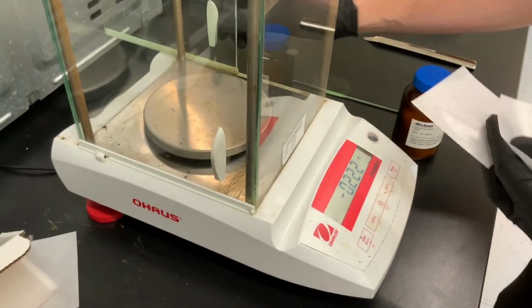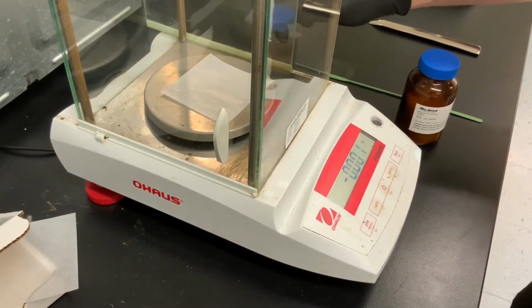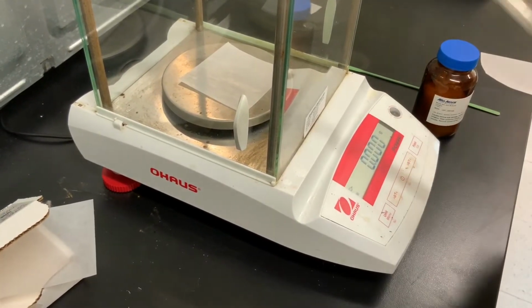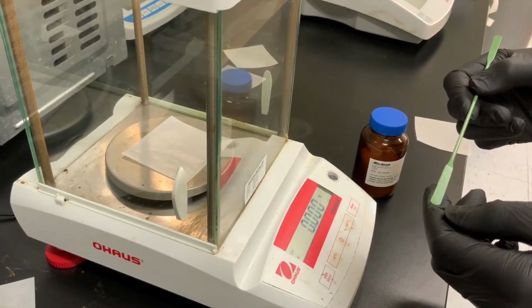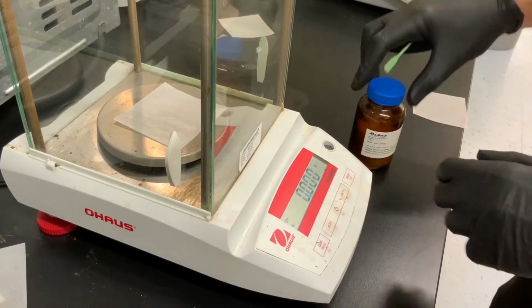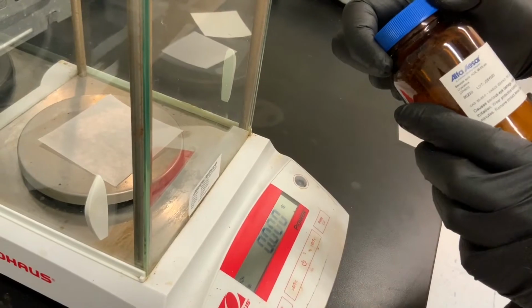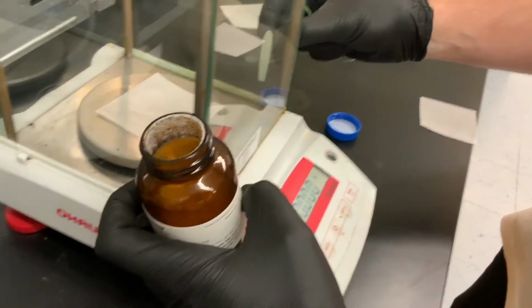And so we're going to put down a piece of weighing paper on the plate of our analytical balance. We're then going to tare the balance, and we can either use a spatula or this Teflon-coated micro spatula. And so I'm actually going to bend it a little bit so I can pick some up. And so here's benzoic acid, 99.5% minimum, sold by Alfa Aesar. And there's 100 grams in here, so we should be good.